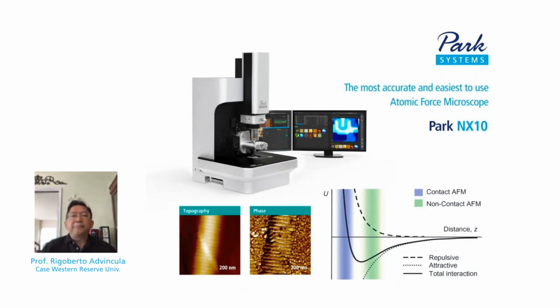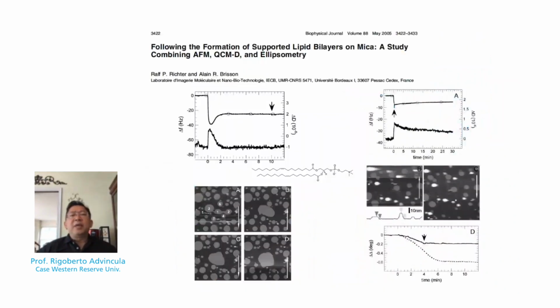So for the rest of the time, I will basically look at several publications where they have combined the study of the phenomena or the films or thin films on QCM, AFM, and perhaps other techniques like ellipsometry and even electrochemistry.